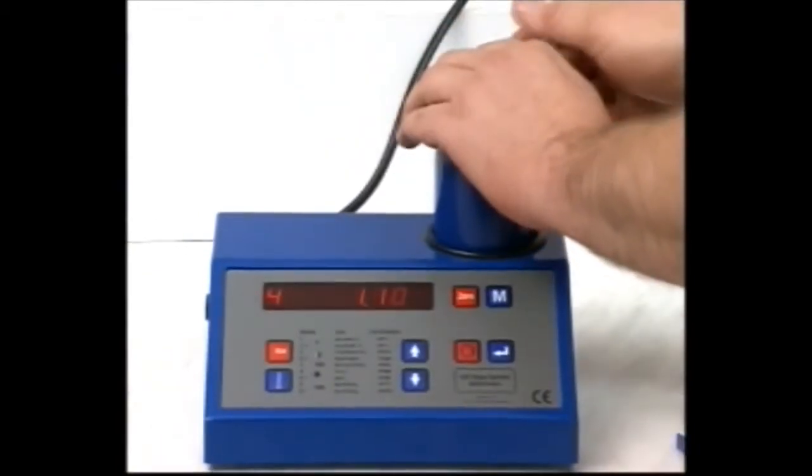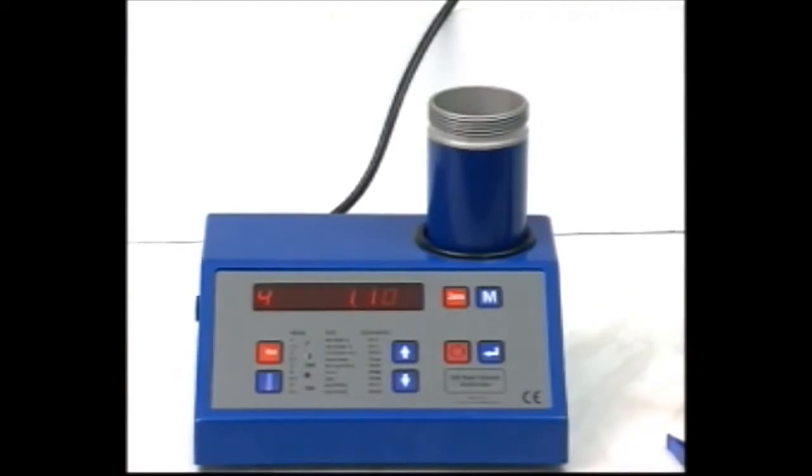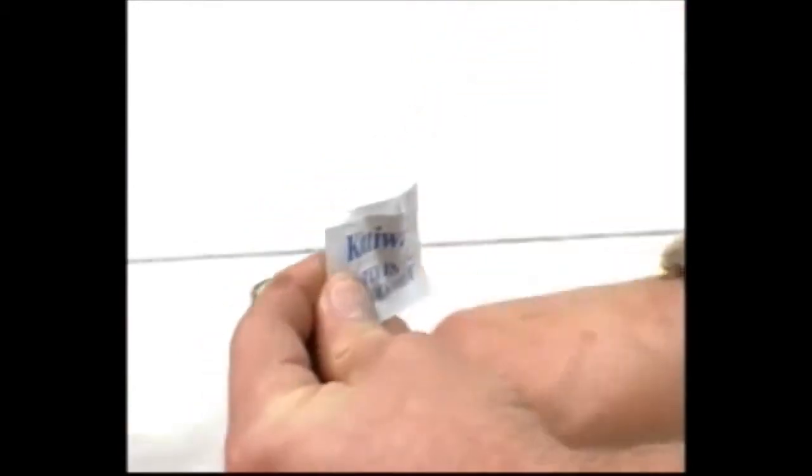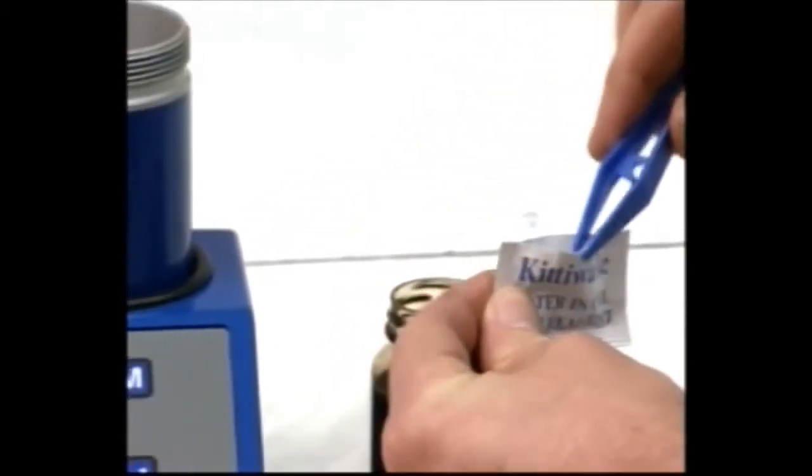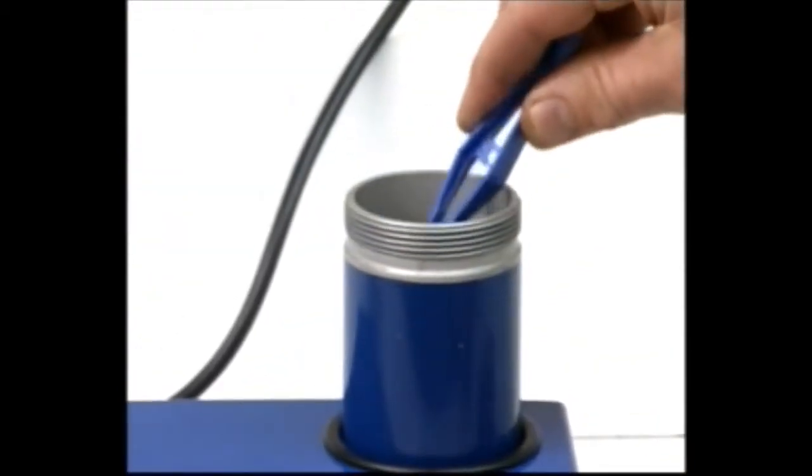Take a sachet of reagent B. Be very careful with this. Don't inhale it and mind your eyes. Cut the sachet along the dotted line, pinch it like this and place it upright in the cell, being careful not to spill it. Now replace the cap tightly.